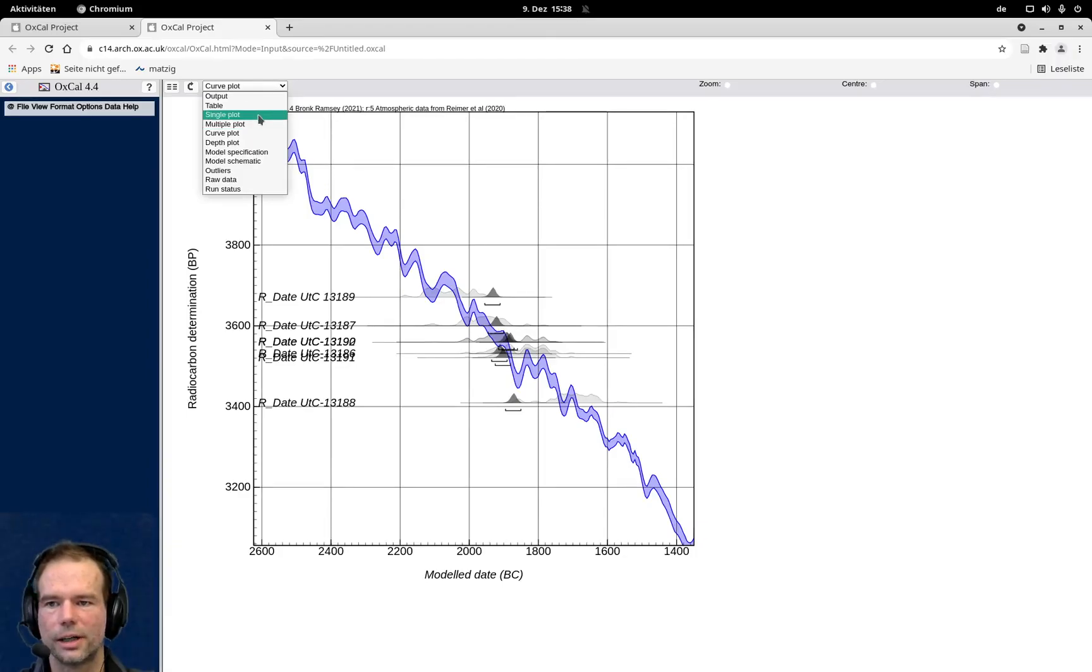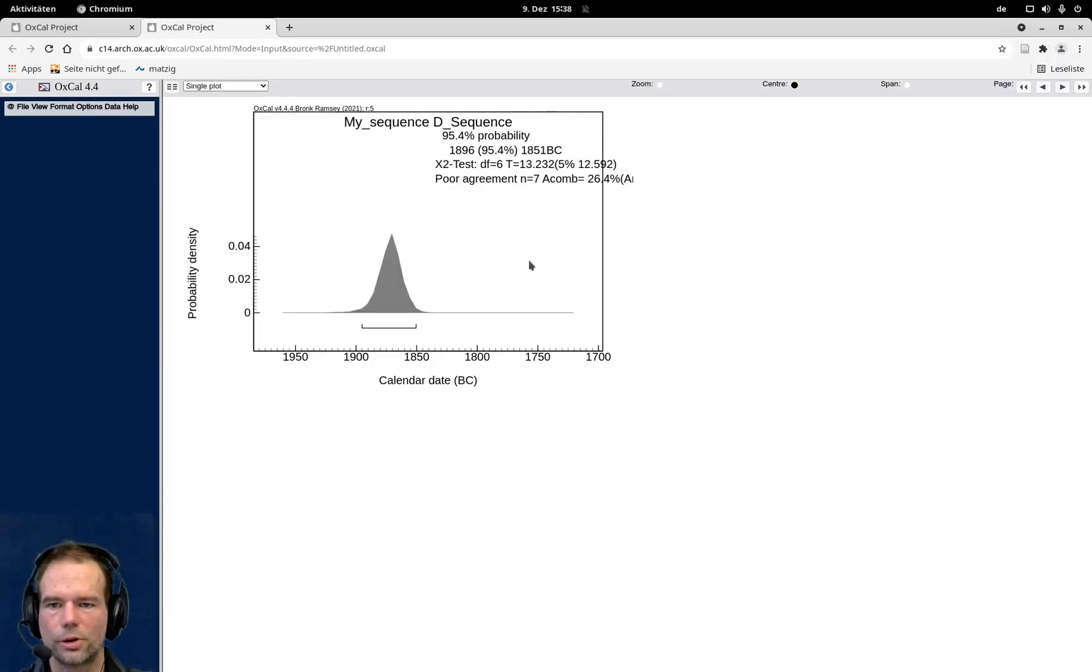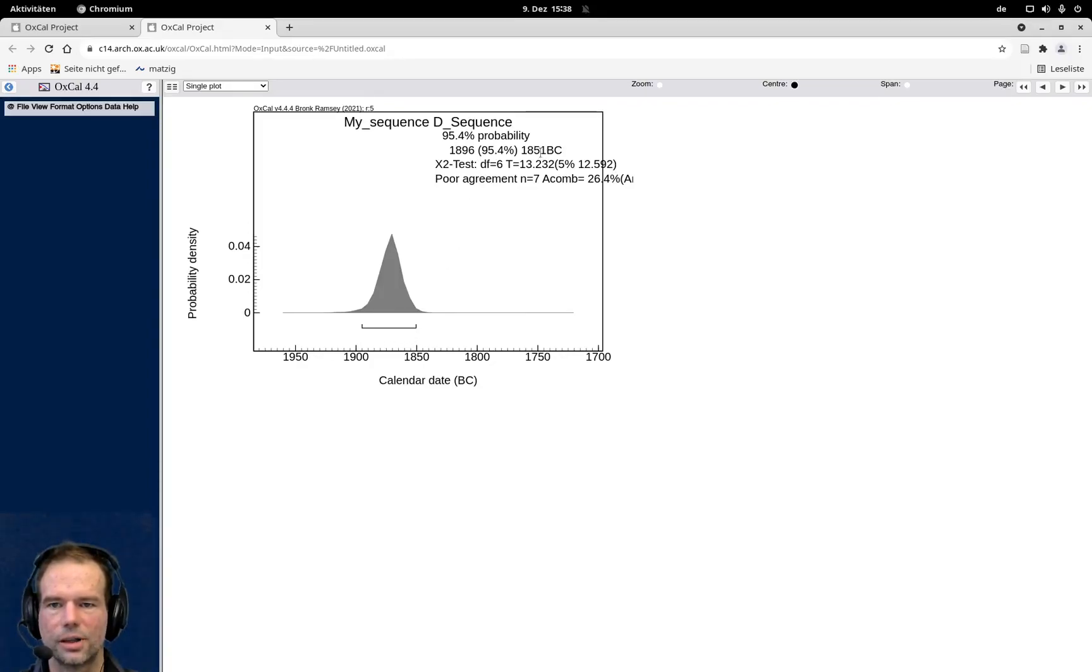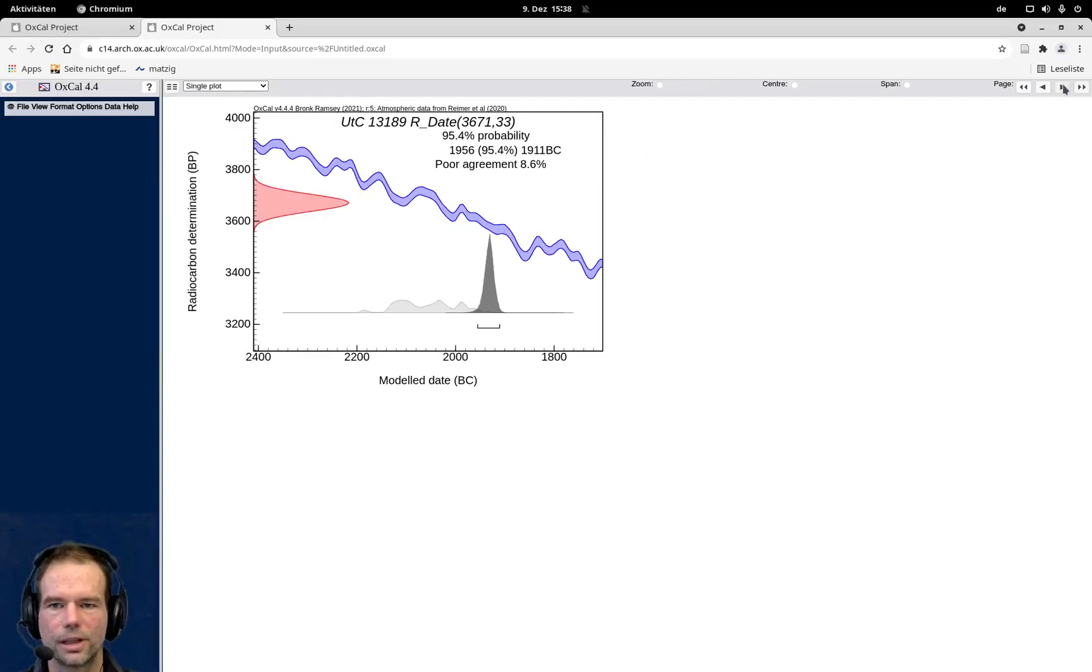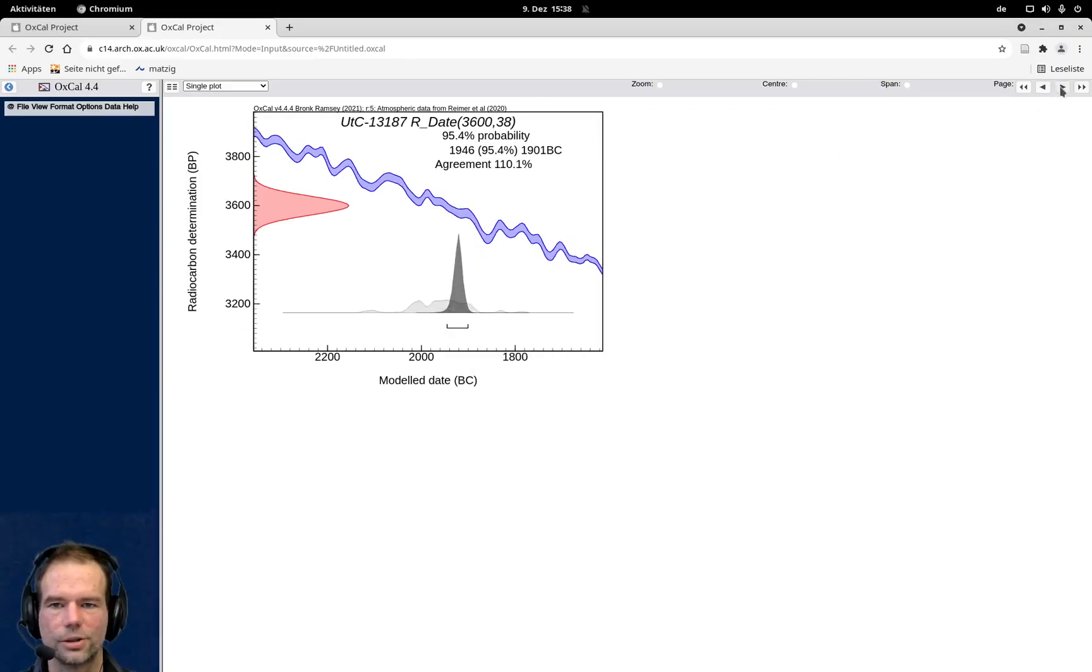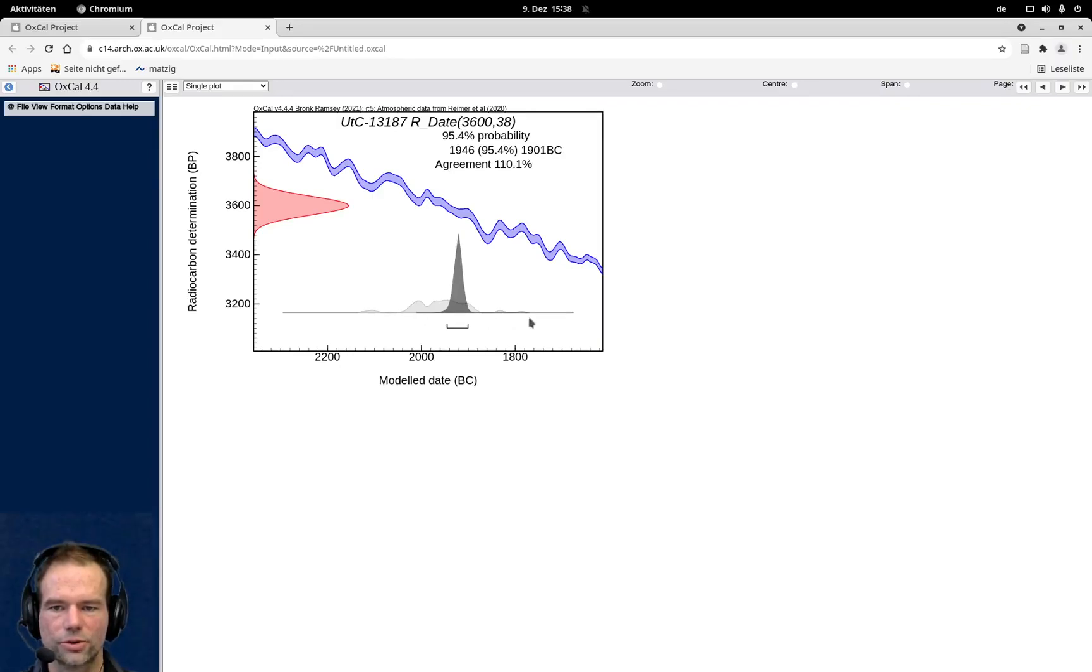And I can also look at the individual dates here and can see the individual probabilities. You can see that the range has narrowed down, in that case, to 50 years with a 95% probability. And here it's even shorter with 40 years and here also 40 years compared to the range of the unconstrained calibration.